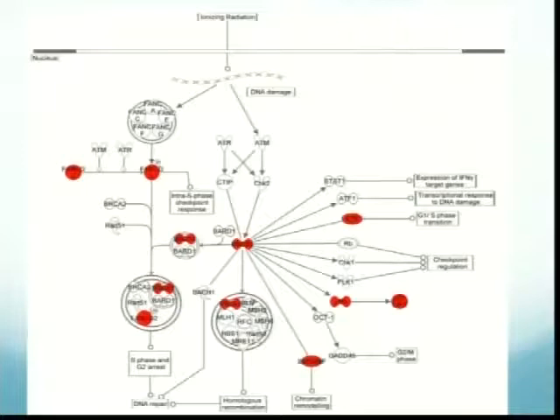Actually, these are somatic because this is the tumor samples. So you're looking for the families and the justification. Yeah, I didn't show it because for the sake of time, I took out the process. But essentially, we called mutations and then we subtracted any mutation that was in dbSNP or the 1000 Genomes Project. So we got rid of a lot of these common germline variants. But this could still be germline. It could be. Yes. Track that only a small percentage of cells will have the recurrent ones. No, not necessarily. Sometimes it's 20%, sometimes it's 90% of the tumor that will have that somatic mutation. It varies.